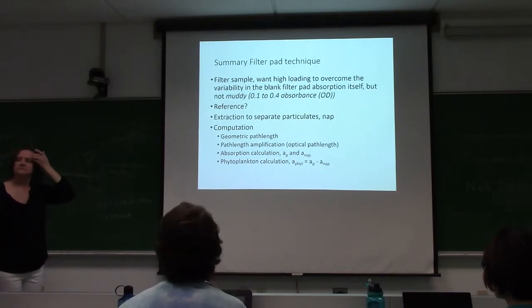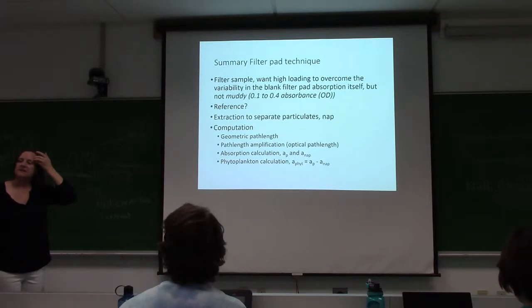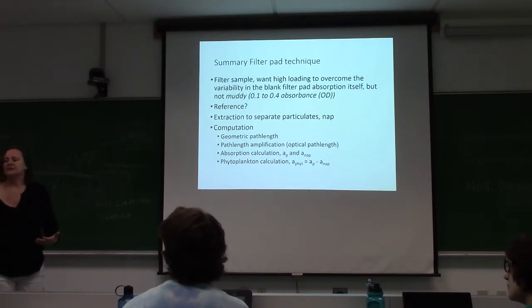Do you do the same amplification correction for both NAP and phytoplankton? Yeah, it doesn't look like it's very different. When you put them together, they show up on the same suite of points, which says that it's more about the filter and less about what's on the filter.